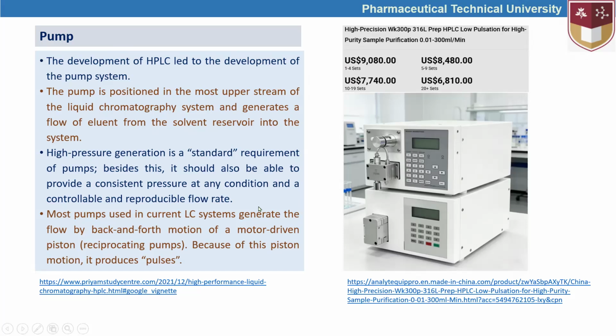As I reminded earlier, pump is very significant because again, we can identify the compounds by comparing the retention time of the studied compound with the standard one. So the exact pressure for the flow rate should be provided.